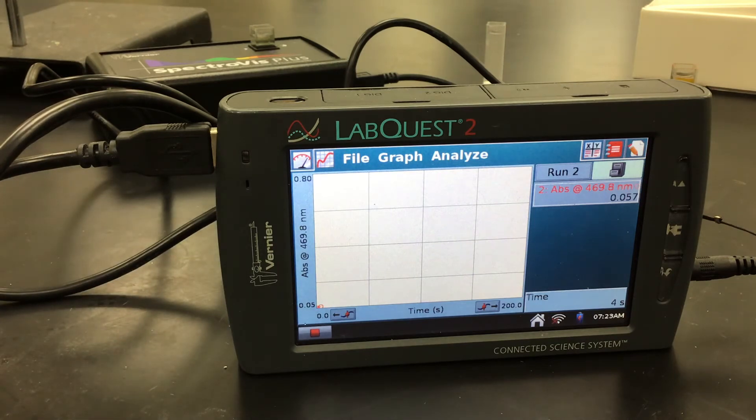All right. So in this one, we have less potassium iodide. So what we do when we're collecting this concentration versus rate data that we're going to have, we're going to be able to compare different runs to each other and see how the rate was affected by changing the concentration. So from the first trial, the second one, we kept the concentration or the amount of iron the same.